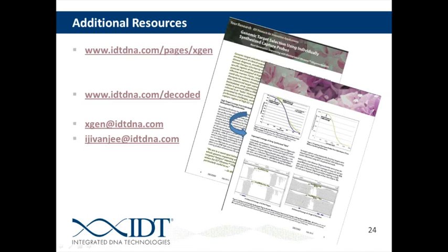Okay, good answer. Here's another question for you, Ibrahim. Does IDT help with the repetitive region workaround if somebody needs to design around repetitive regions? We do not have the repeat masker database in-house as of yet. This is something that we're working on. The support page on our website actually has instructions on how to mask for repeats, and the type of information we would need to tile around those repeat regions.